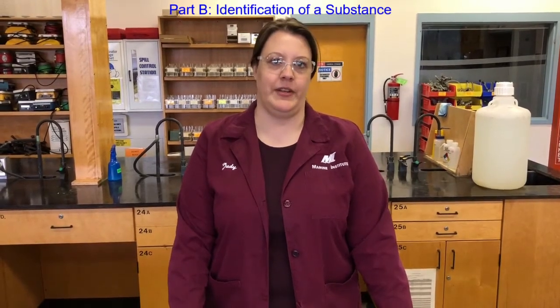Hi everyone, it's Judy here again, and today we are going to do part B of experiment 2 in Chemistry 1100, which is the identification of a substance. A common problem that chemists encounter is identifying an unknown substance. An unknown in chemistry is a substance which has an unidentified identity, so we don't know what it is.